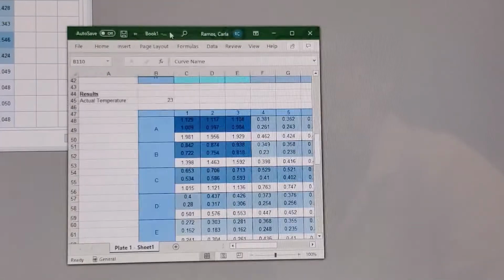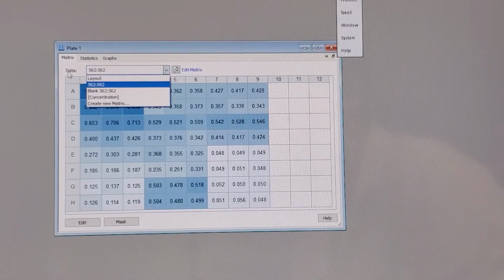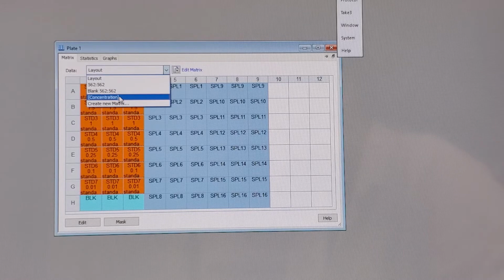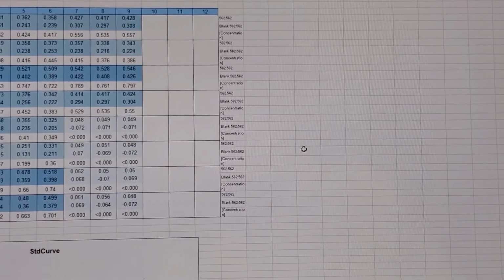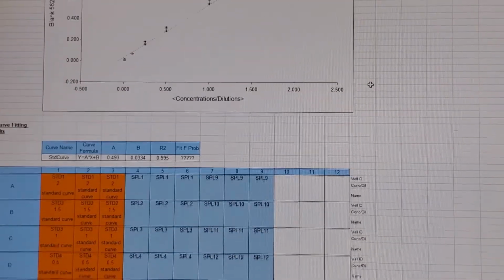If you don't like this, what I like doing is coming onto my software that you see here. These are my readouts, and you can tell it to separate them. For example, if you label all your layouts, you click on layout and then click where it says Excel. And so it will only show you this layout. Another thing I like doing is going onto concentration, clicking on concentration, and then clicking onto that Excel symbol. And so when you come to your Excel, I'll make this a little bit bigger for you to see. Instead of putting all the values together, it gives them to you separate.